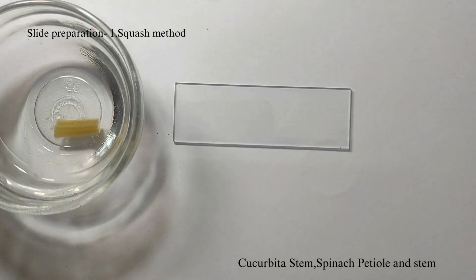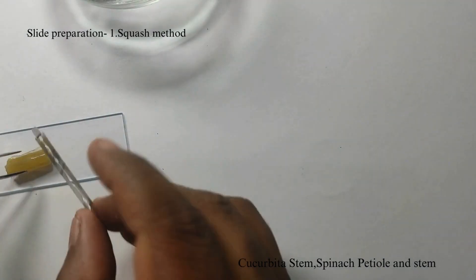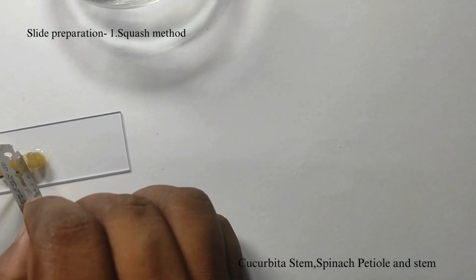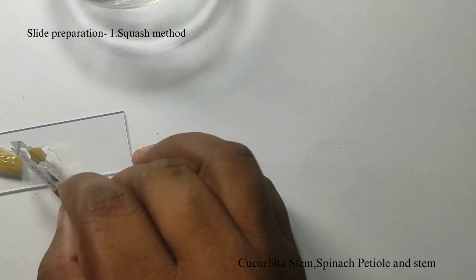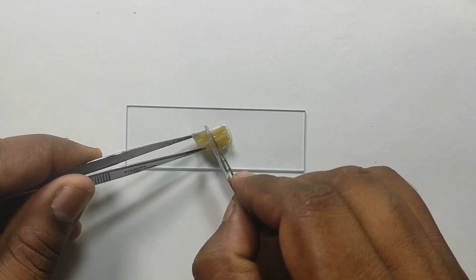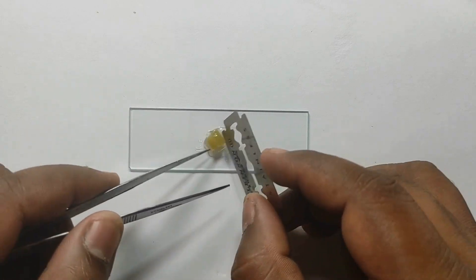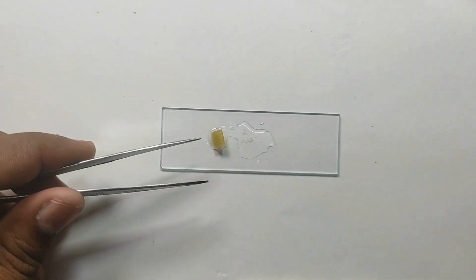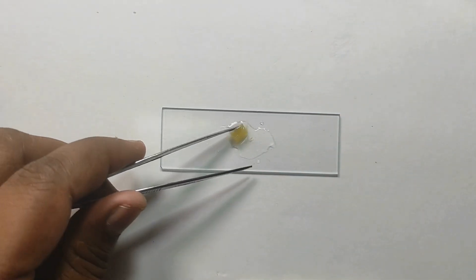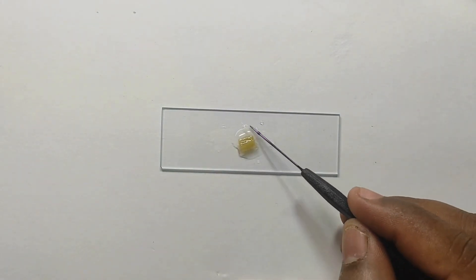Slide preparation using the squash method. Take the macerated stem and wash it in water. Transfer the material onto a clean glass slide. Using tweezers and a razor blade, split the stem and apply the stain. Leave it for 50 to 60 seconds and squash it.